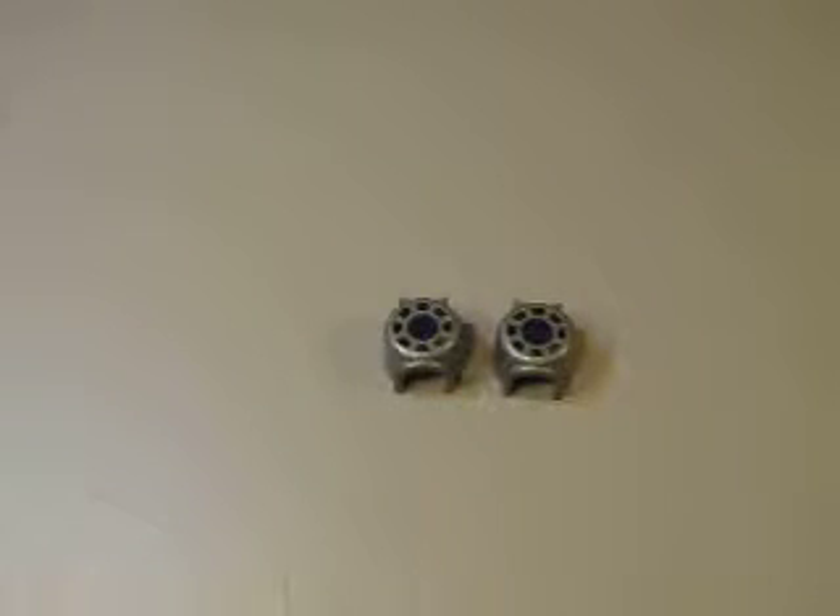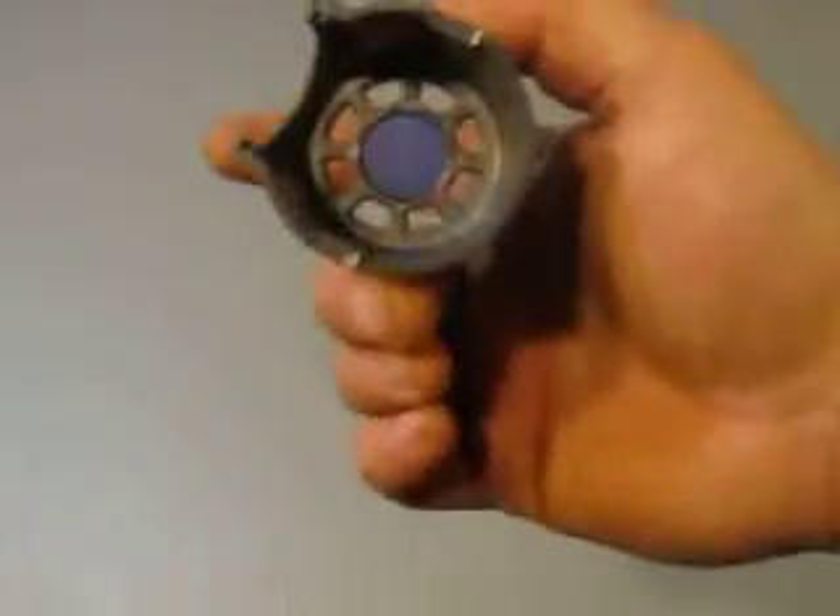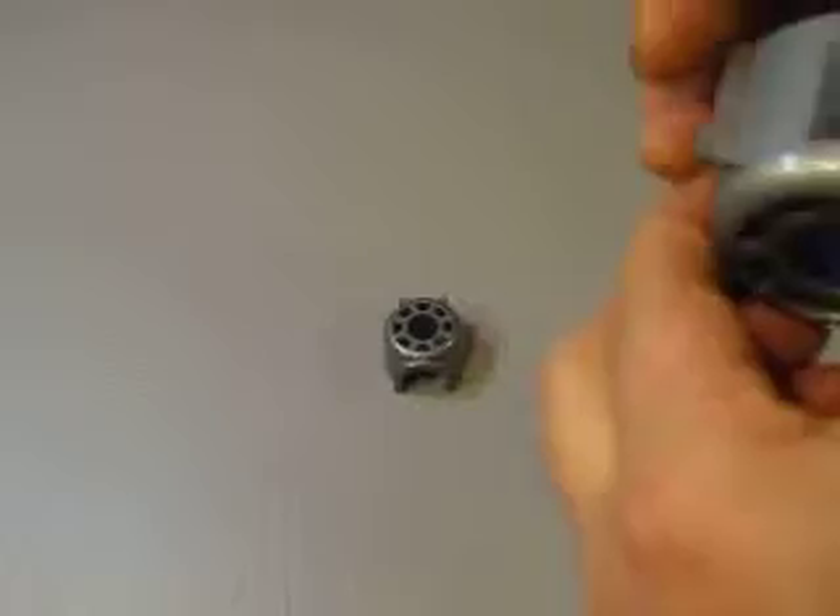Up for auction we have two light covers with blue filters for our microscope. So there's the cover. There's no name on them. It's nice and grey though. Almost brand new.